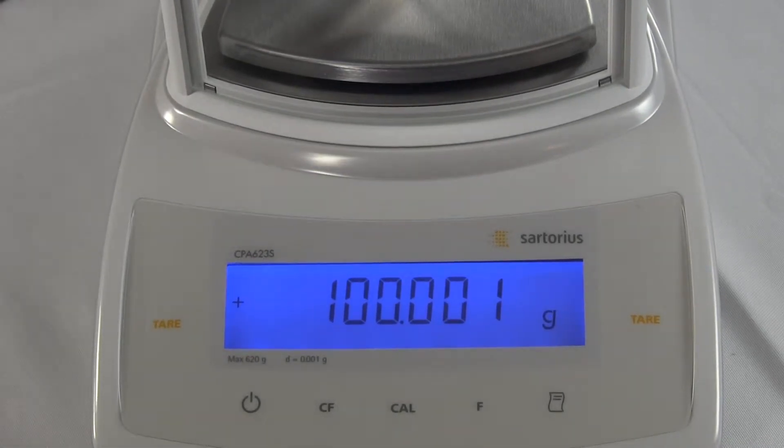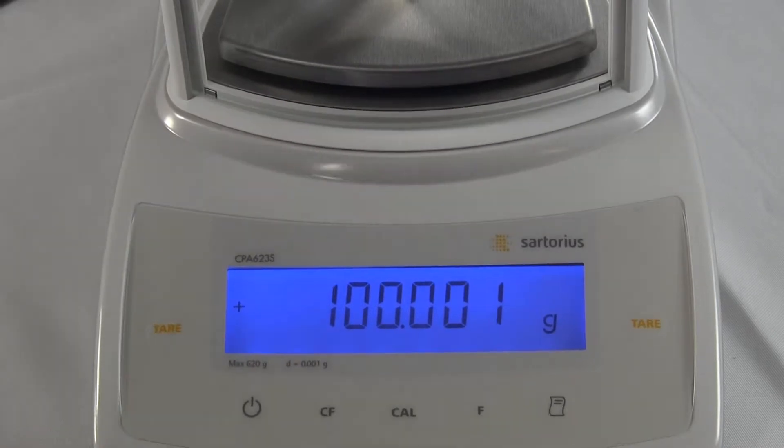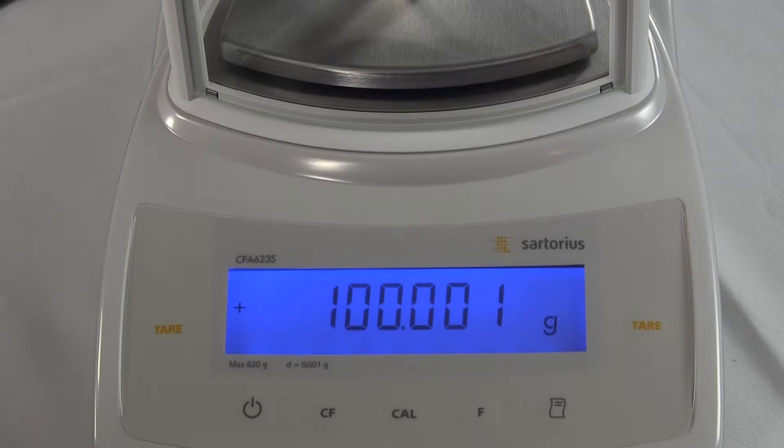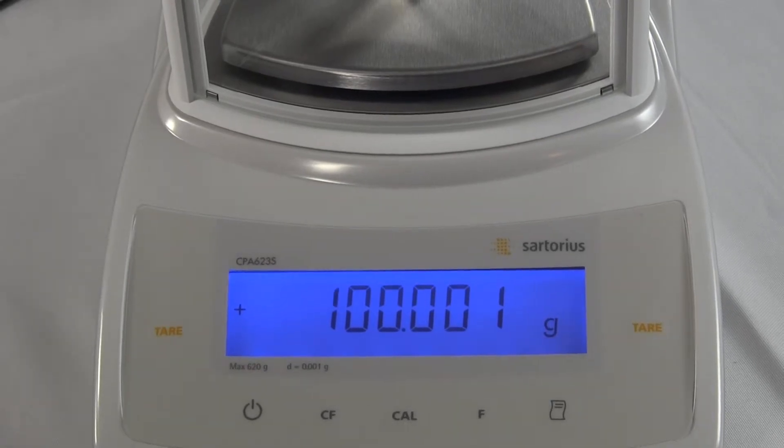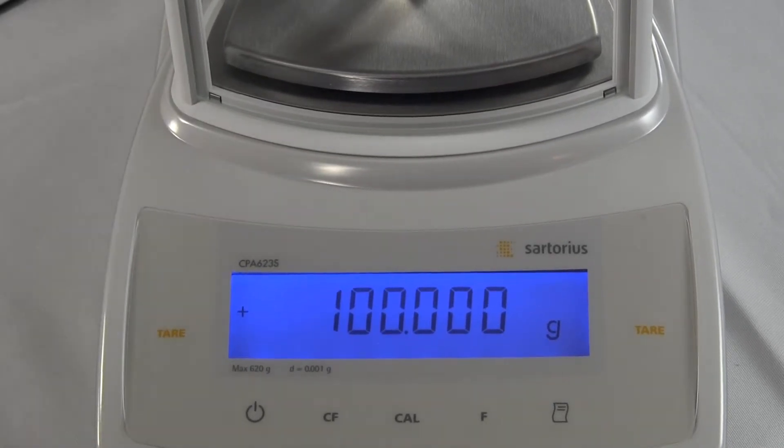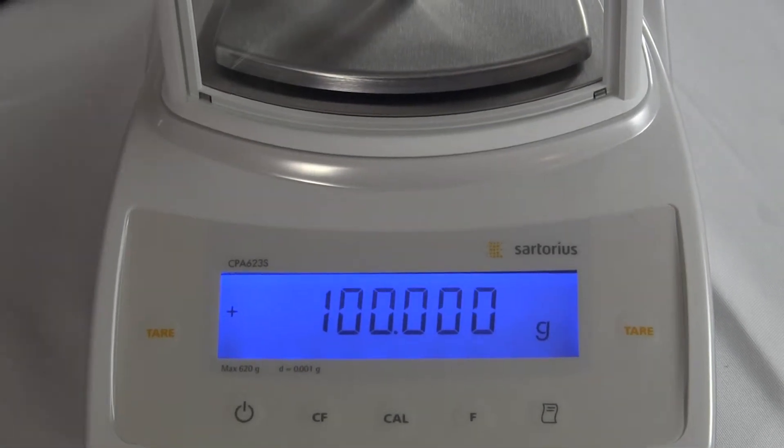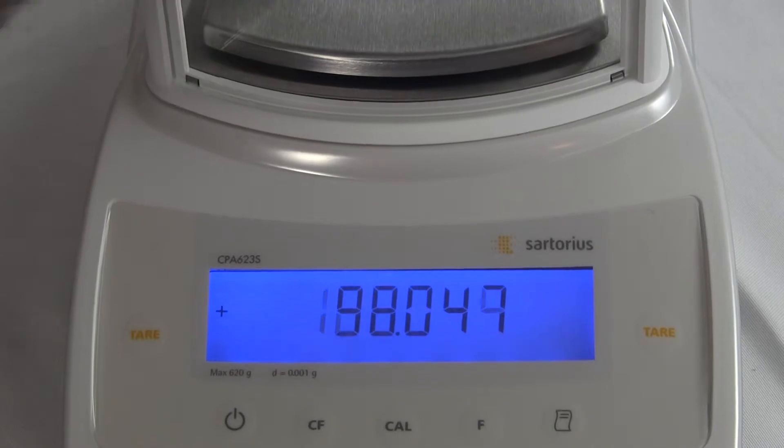Sartorius has been making balances for over 140 years. They have the weighing technology and expertise. They hold the Guinness Book of World Records for the most accurate balance in the world. So when you're looking for the ultimate in performance, Sartorius is the only choice. You can see the balance, how well it performs.